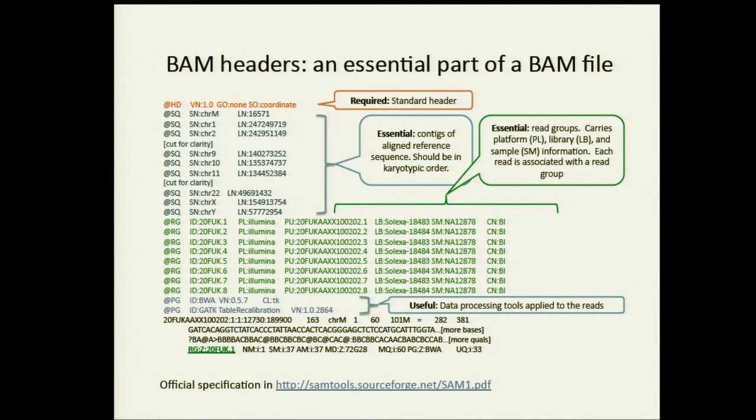And why is that important? Because the read group tells you, first of all, the sample name. So when we're calling SNPs later on, we're using this information to divide up the reads into the appropriate sample bins. Also, Ryan will show you later, the sequencing machines make mistakes. We want to find which errors are associated with which read groups. Each read group has different covariates of error, a different extent to which they are error-prone. Again, I have the links here, so later on, when you get these presentations back at home to peruse over coffee, you can go back and look at more details.